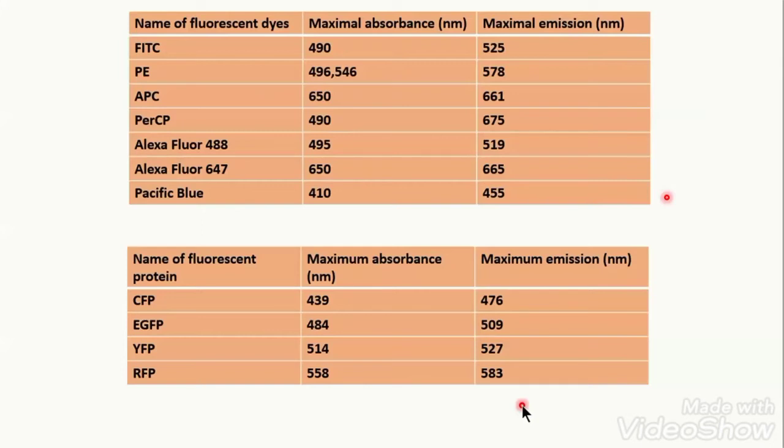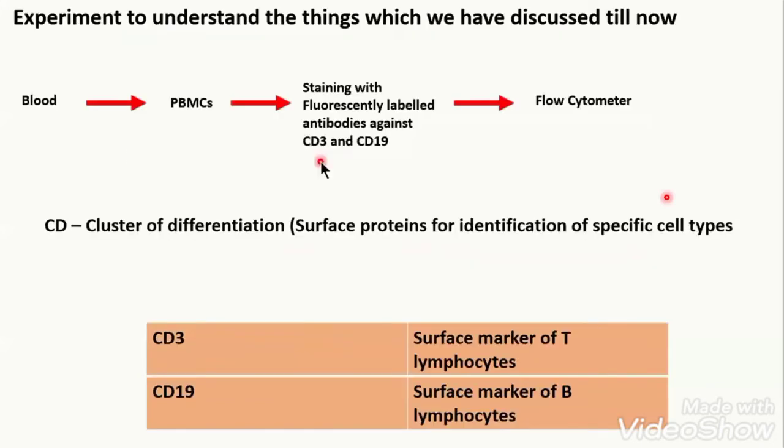Now let's start doing the application. So we start with one very simple application that you have injected. So I hope there are pharmacology students here or people who are working in the field of pharmacology here. So imagine you have added or you have injected a drug intravenously and to see whether that particular drug can analyze or can do the immunomodulation in the rat, mouse, or human or whatever.